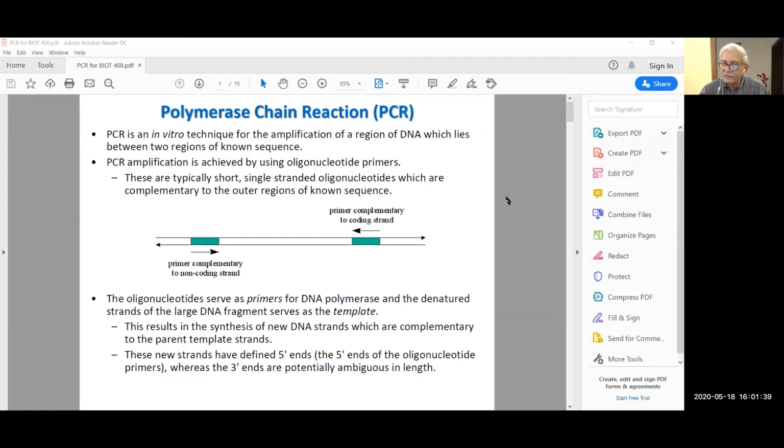The template for a PCR reaction can be a double-stranded DNA, it can be a single-stranded DNA, okay? Double-stranded DNA is usually the genomic DNA isolated from an organism. It may be mitochondrial, it can be chloroplast, or it may be a total genomic, which includes all the three. Remember, the word total genomic means all the types of DNA which are present in that organism, whether mitochondrial, chloroplast, or genomic. Then when we say genomic DNA, it means it's only from the nuclei, okay?